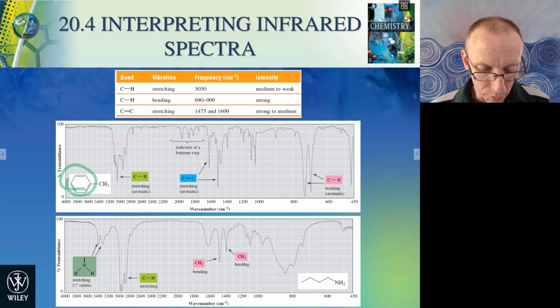And they have vibrational stretching modes in this 1,500 and 1,600 region, quite sharp like that and quite strong. And then we've got some CH aromatic bending here, so quite low frequencies. They're CH bonds that are bending out of the plane of the ring.